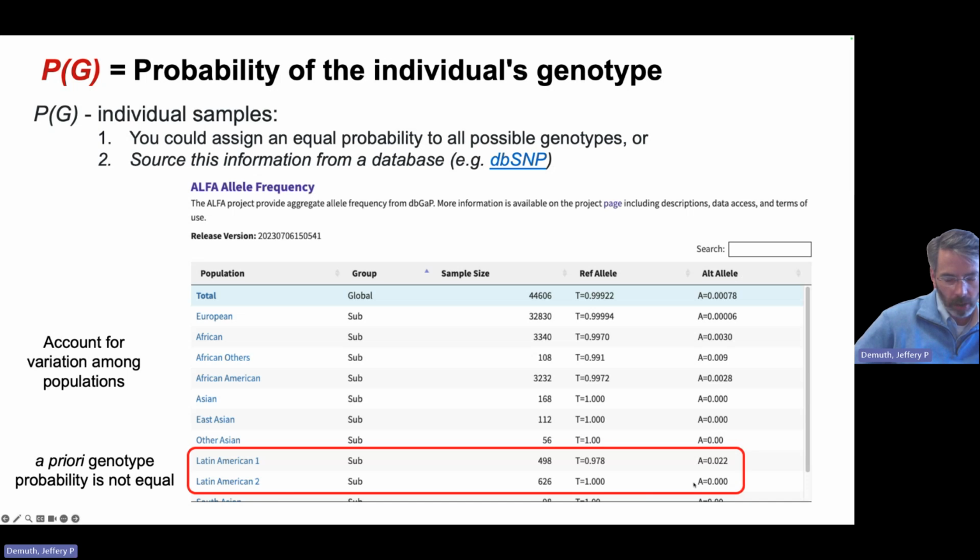Your variant caller should say there's a very low probability of getting an A at this position. So it's very, very unlikely to be a homozygote for A, and even, right, it's in some sense impossible, given what we know, that you could be a heterozygote even. Okay, but if there's lots of evidence, right, so how would you call a rare heterozygote in this population? You would have to have enough reads, like 50% of your reads be A and the other 50% be T, to have high confidence that you should be calling a heterozygote genotype at that locus. Okay.